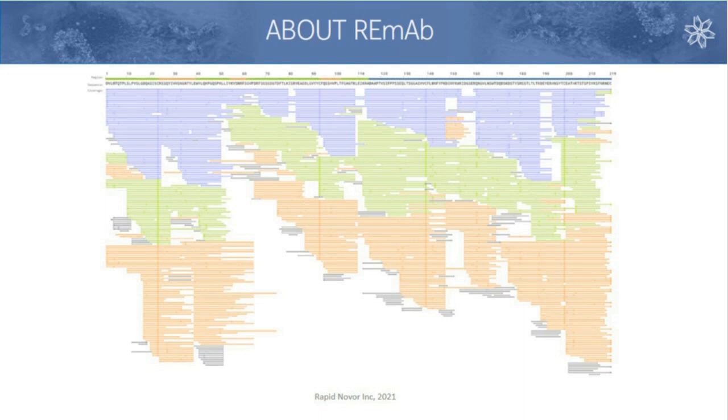Of course, this is an excellent case. This is NIST, and so it should look good, but it does, which is reassuring because in terms of how we benchmark ourselves, when I started with the company, we were hoping to achieve at least 3 to 5 overlapping peptides of coverage over every single amino acid, including the CDRs. And if you look in the literature, I think that would be a really high score to achieve, certainly if you investigate our contemporaries in an academic setting.